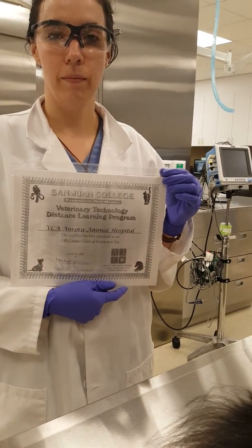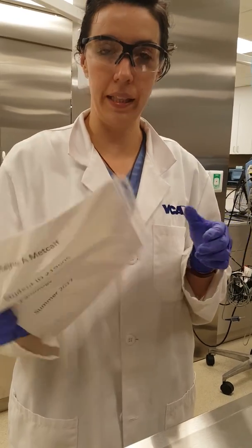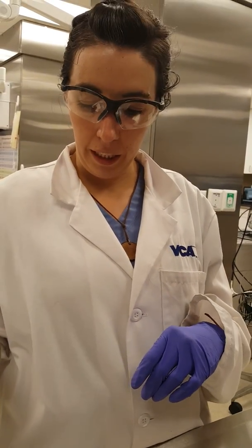Here with San Juan College video portfolio for Vet 222, summer of 2017. I'm going to show you guys today Task 5, which is performing the DTM culture for dermatophytes.